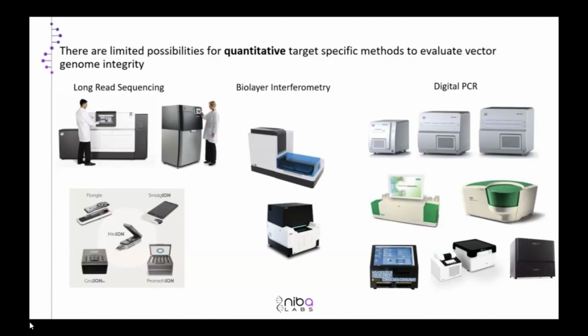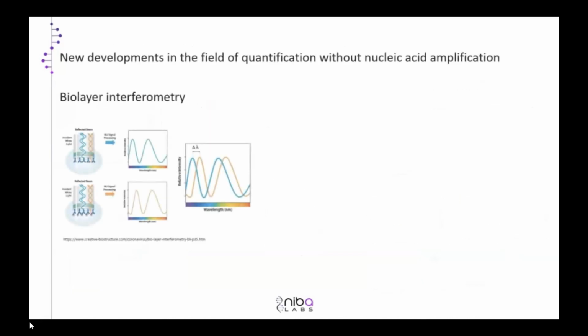So until now, as presented also by Vasu, Biolayer interferometry was used for evaluation of different quantities of proteins, some evaluation of protein interactions or molecule interactions.